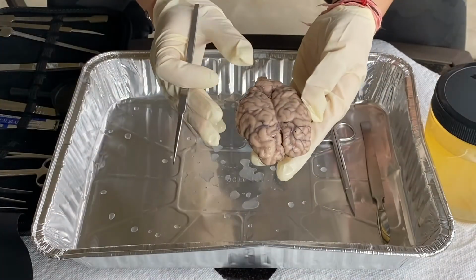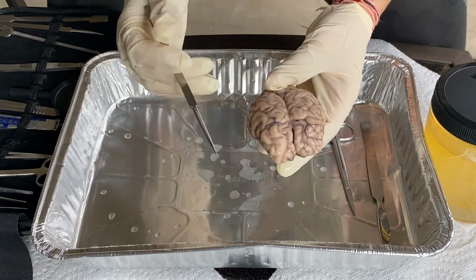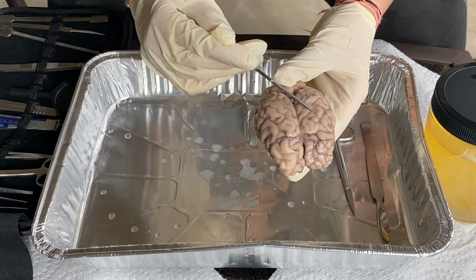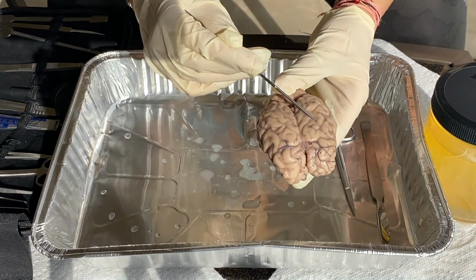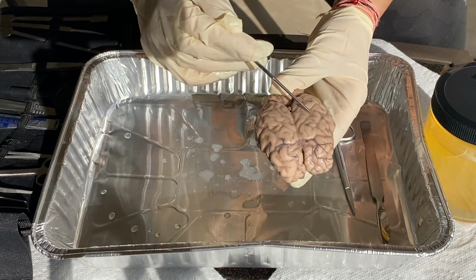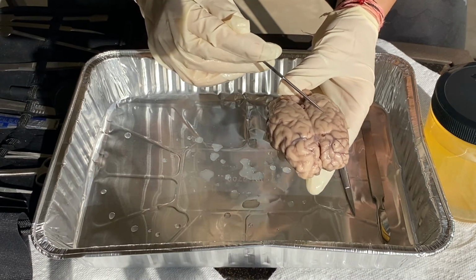So before dissecting the brain, I'm just going to analyze and discuss some of the external structures. For example, this is the left hemisphere, and the left side of this represents the left side of the brain, and it's basically responsible for controlling the right side of the body, because it's contralateral. It also performs tasks that have to do with logic, such as science and math, as well as language and speech, and it's often called the dominant hemisphere.